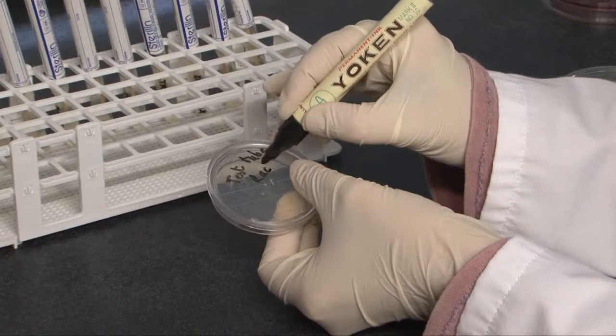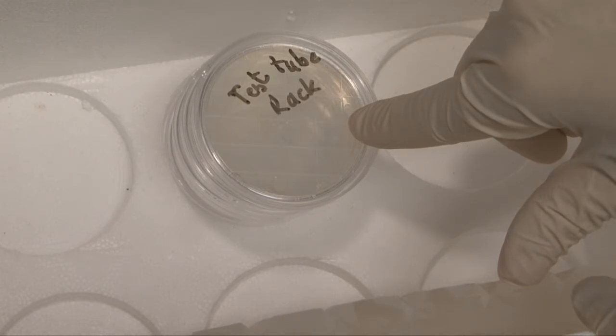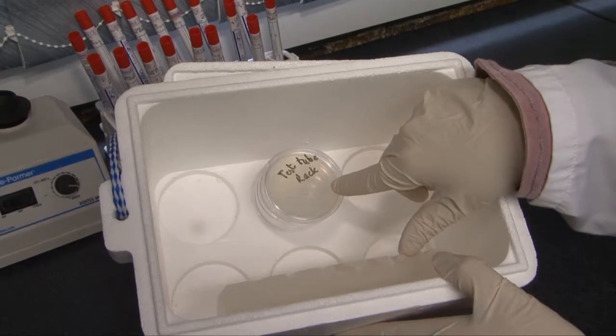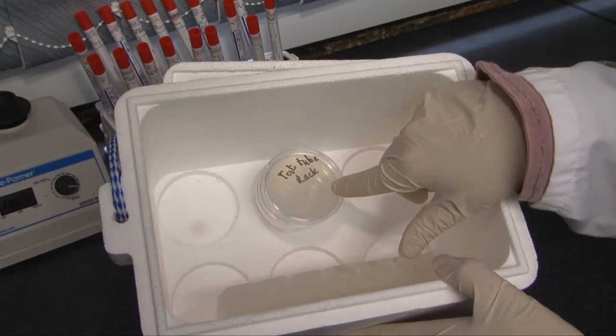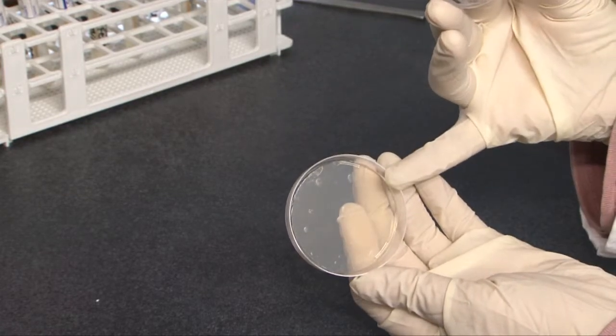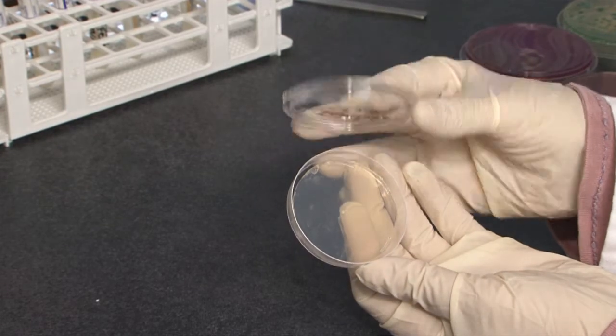Clearly label each plate on the base of the Rodac plate of the area sampled with the date. The sealed Rodac plates are then placed inverted inside an insulated container with an ice brick to maintain the temperature at about 4 to 8 degrees Celsius. They are inverted to prevent condensation from the lid contaminating the agar surface. Transport all contact plates post-haste to the laboratory.